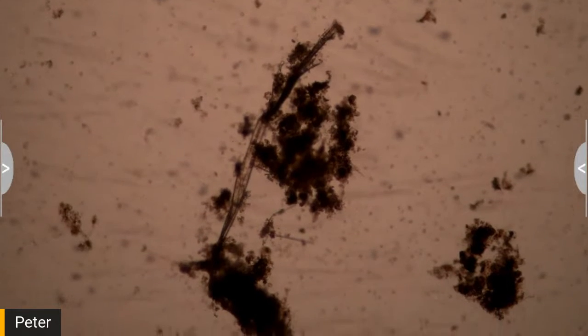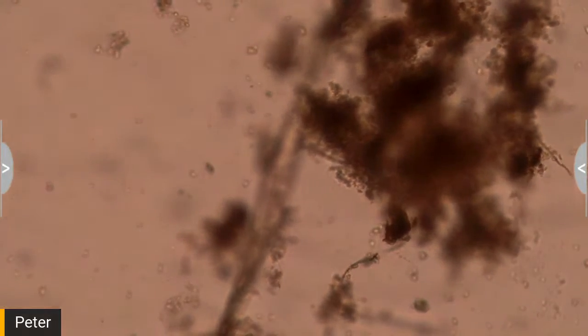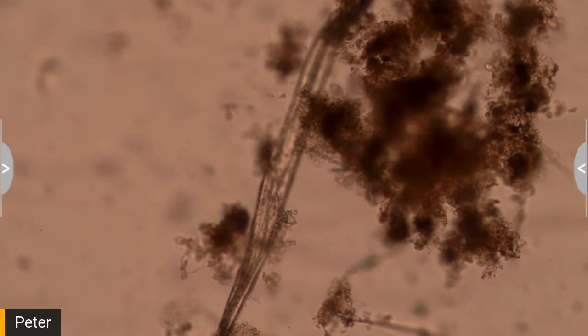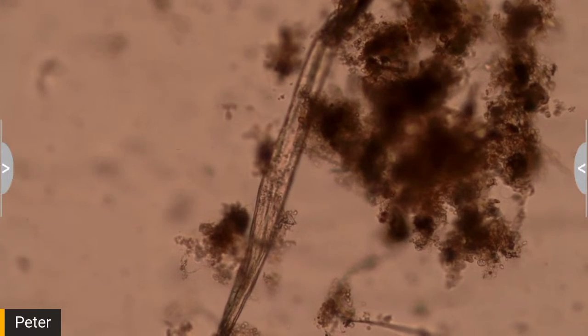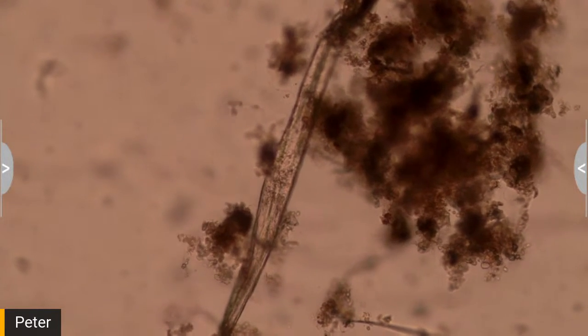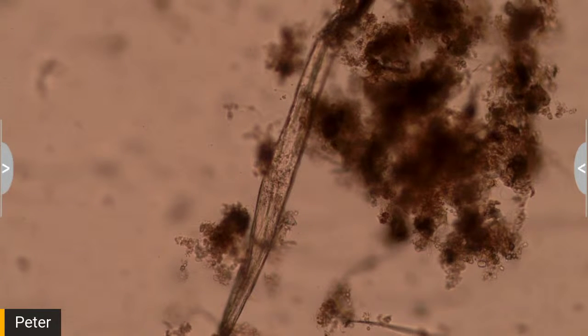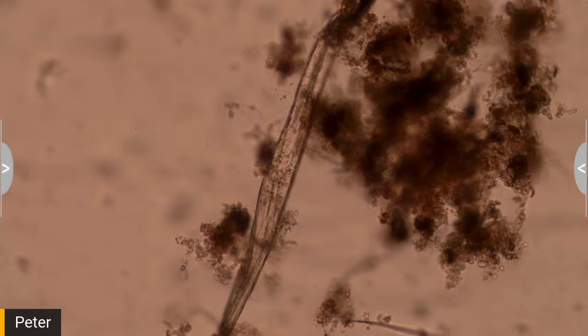Alright, we'll come back to you. Let's go up. Let's see what's going on in here. I'll pour in some mammoth pee and see if... Yeah, well, yeah, this is an Amscope. Yeah, it's an Amscope that my friend who used to work at Amscope gave to me, which was very satisfying. I actually have two of them, but since we're starting to do more microscope stuff, I figured I'd set it up in here. Anyway, I'll be back with more interesting stuff.